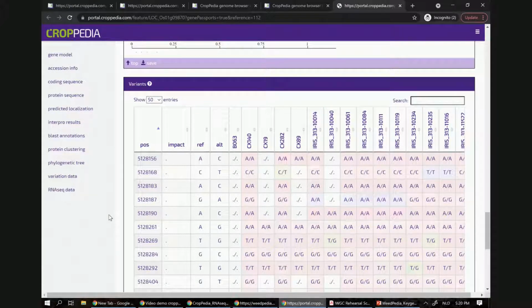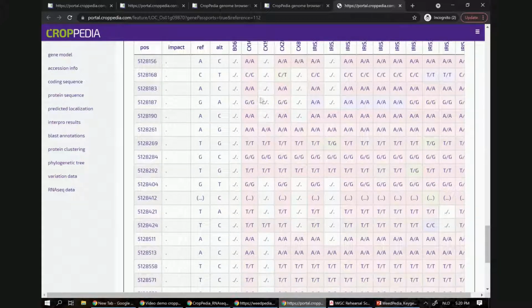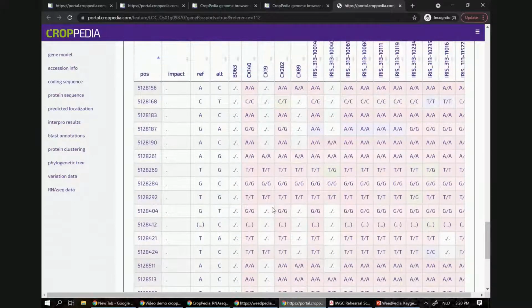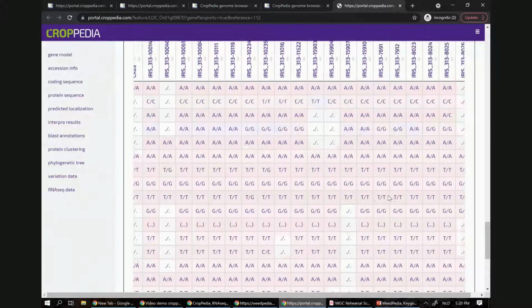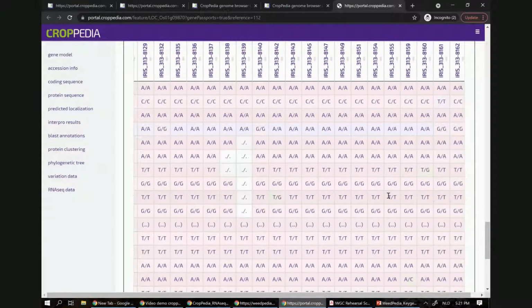And for good reasons, you believe that this phenotype only relates to a single gene and is likely a loss of function of this gene. Then you can simply have a look at the variation data for each and every single gene and see if you find a potential variant that correlates well with the sample groups that you defined.